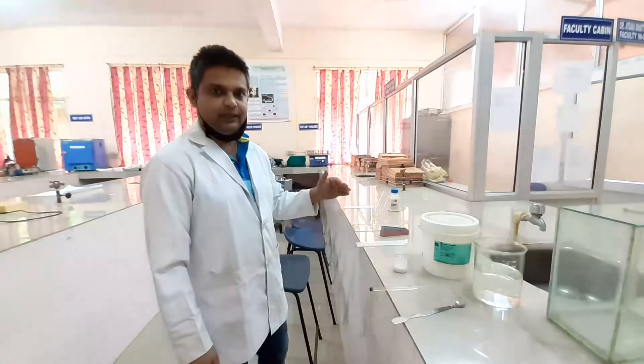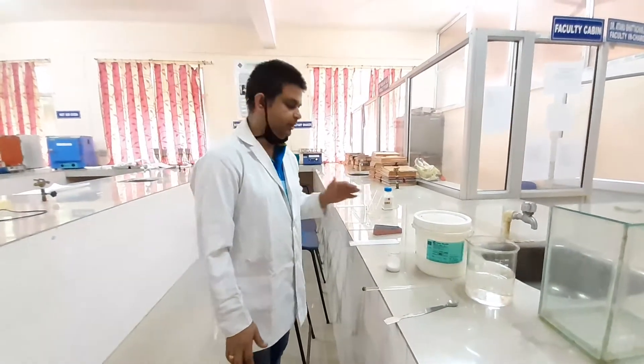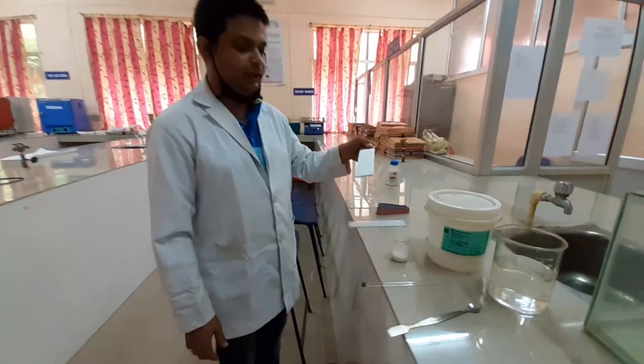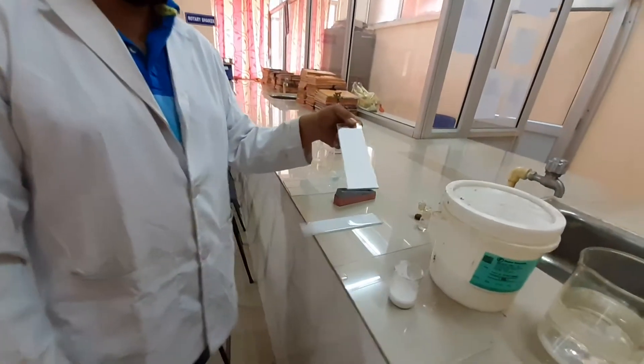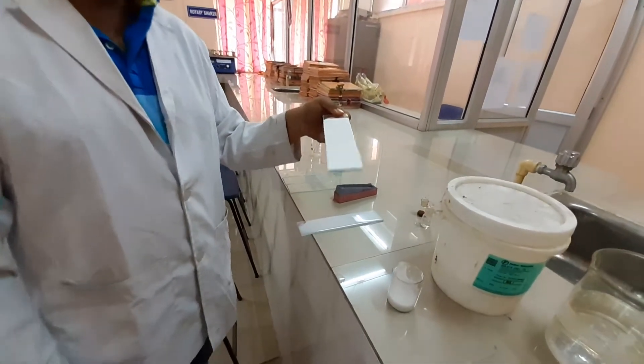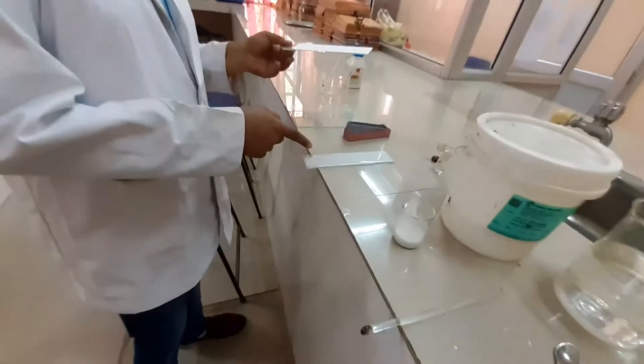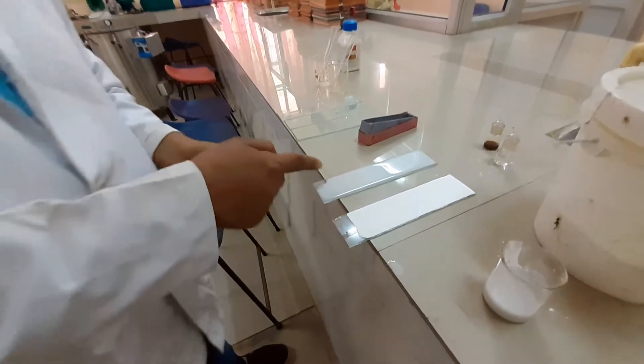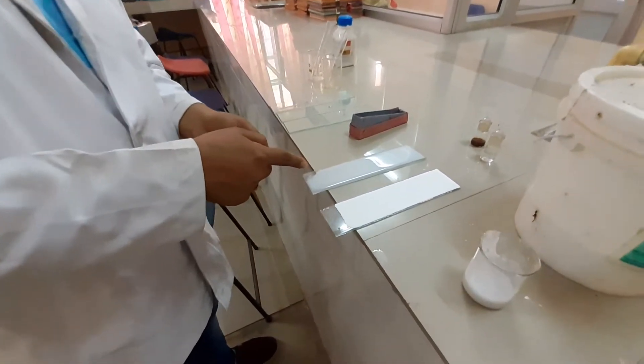After drying at 110 degrees centigrade for 30 minutes, the plate you obtain will appear like this — this is the prepared TLC plate. You can see the difference: this is the one just now prepared, and this is the fully prepared TLC plate.